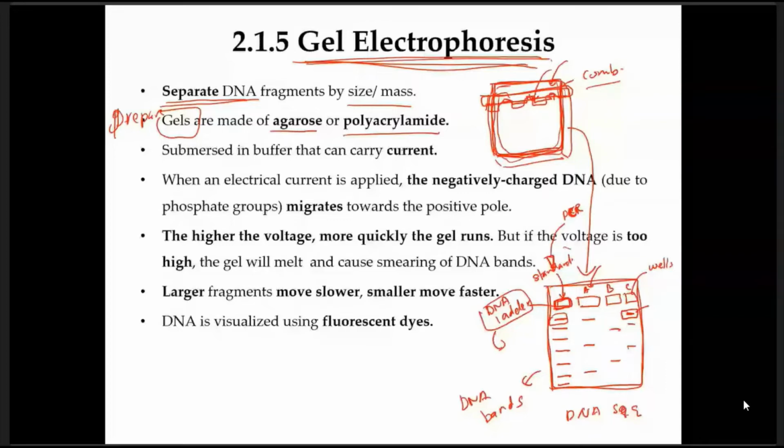So gel yang awak dah prepare tadi akan ada satu tank. Okay, akan ada satu tank yang mana awak akan letak your gel with the well. Okay, and then you pour the buffer inside the tank. Buffer tu akan tenggelamkan sekali gel tu. Okay, the buffer will submerge the gel also.